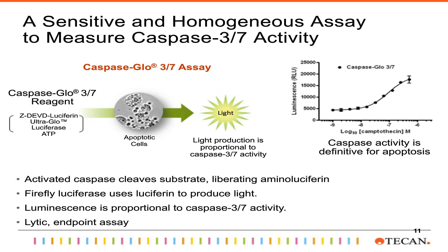And that's what we're showing here in the graph on the right. So with increasing concentration of our compound, we see more apoptosis induction, more luminescence is detected. So an important thing to note about the caspase assay is that this one is lytic and it's endpoint in nature. So unlike the previous two assays, once we add this one to the well, it lyses the cells and we can no longer use those samples for any further analysis.